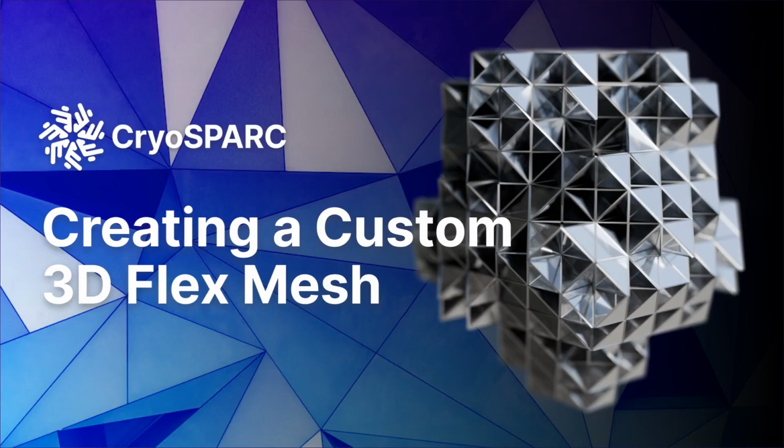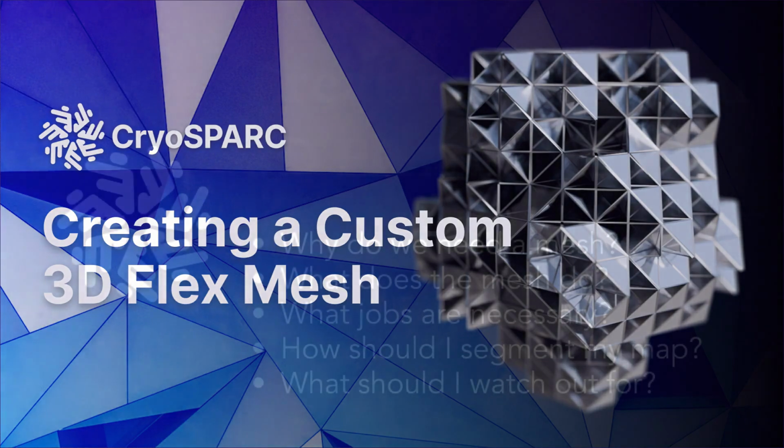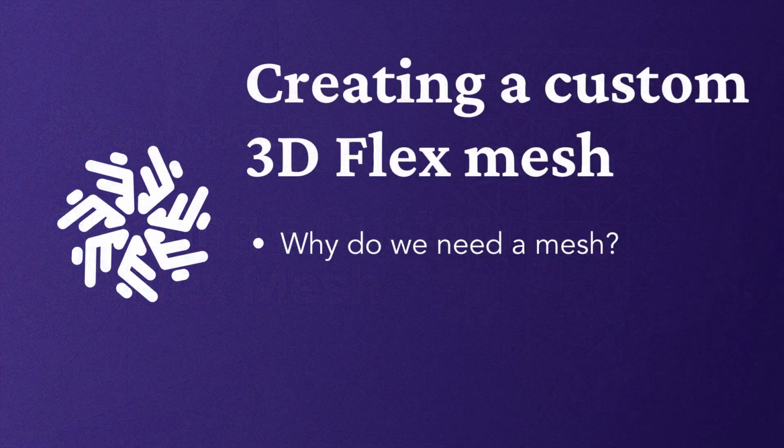This time I'm going to be covering an in-detail procedure for creating a mesh, and these meshes are used for 3D flexible refinement. This is an exciting, relatively new technique in CryoSPARC, but it has this additional constraint of the mesh. And so today I'm going to go into a bit of an introduction as to why we need a mesh for 3D flexible refinement.